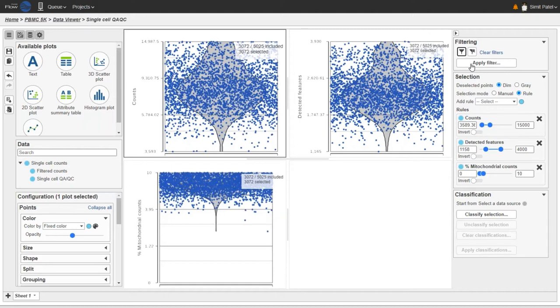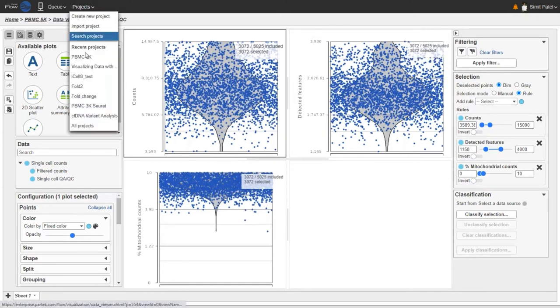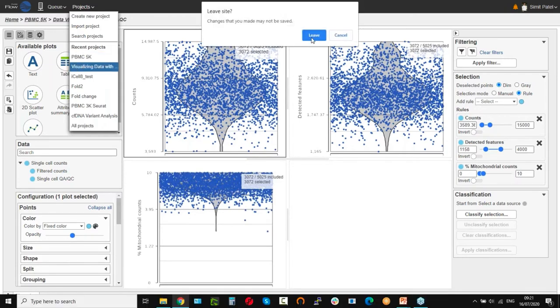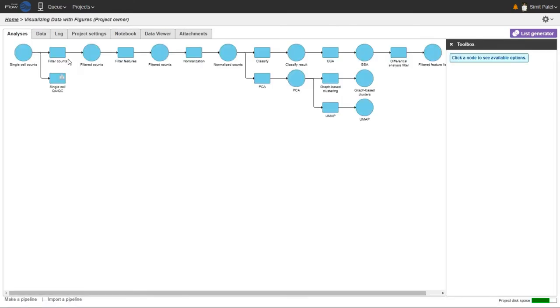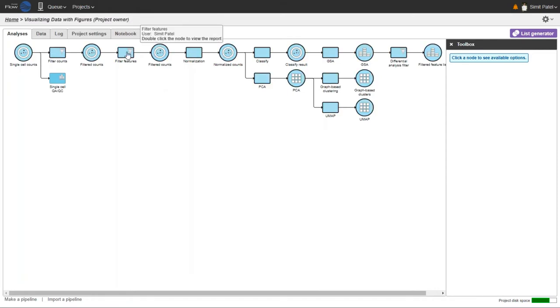Our next topic is dimensionality reduction, which includes PCA and UMAP. I'm going to go to another project I created earlier to save time. This is another project with the same PBMC data, but I've spent a bit more time processing it with additional pipeline steps. PCA and UMAP are commonly used visualization tools to display clusters of single cells that share similar transcriptomic profiles — they can be used to explore the data and discover cell types present in your samples.